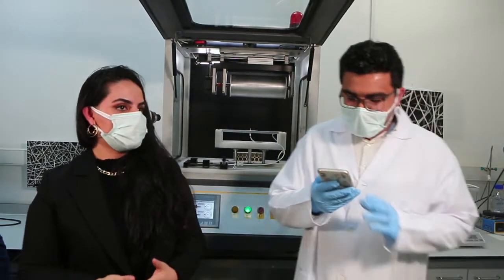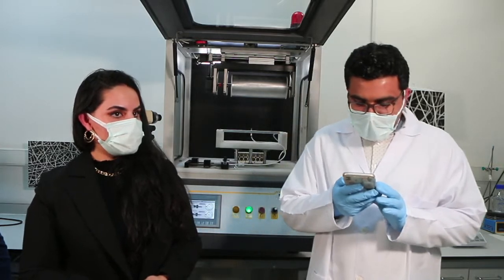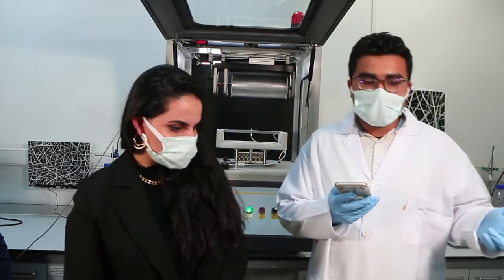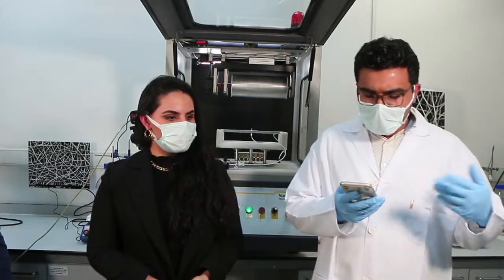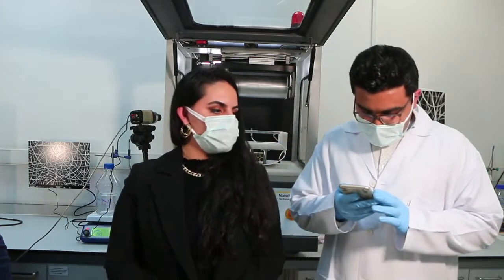Okay, Jacqueline Cruz asks, which are the most common biopolymers, eco-friendly and sustainable, that you've used to create nanofibers? Great question, Jacqueline. Among biopolymers, we've worked with PCL in the past. We've worked with PHB. We have some knowledge of PC, chitosan, and cellulose acetate. So we've actually worked with a lot of biopolymeric polymer solutions.